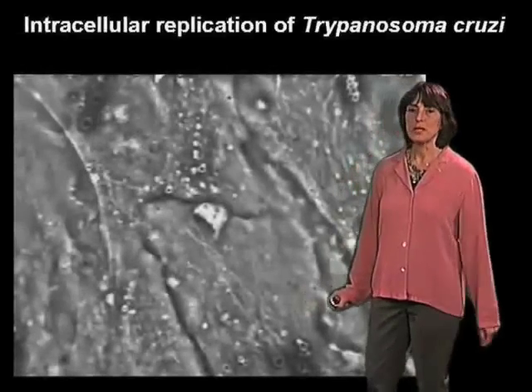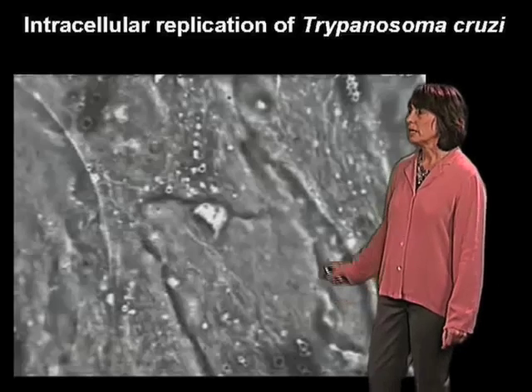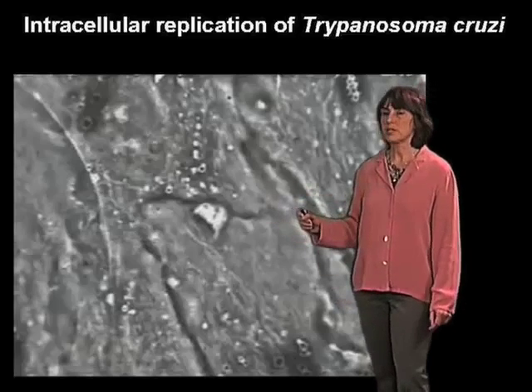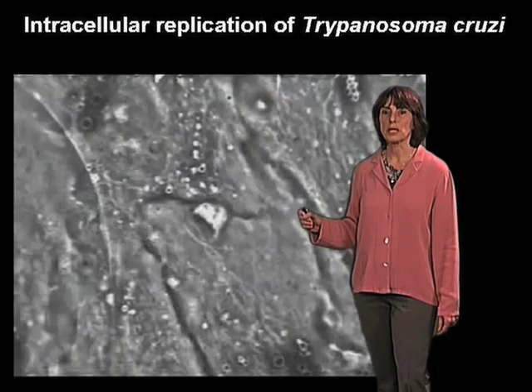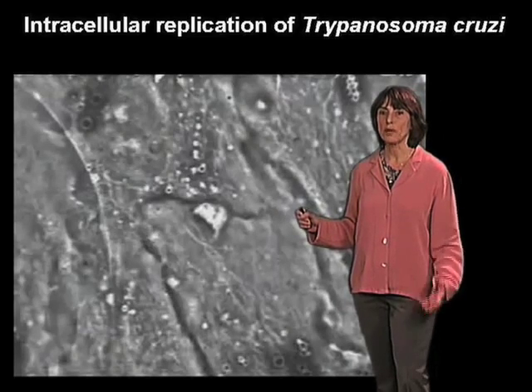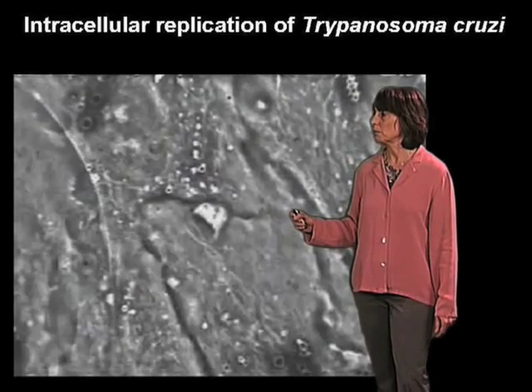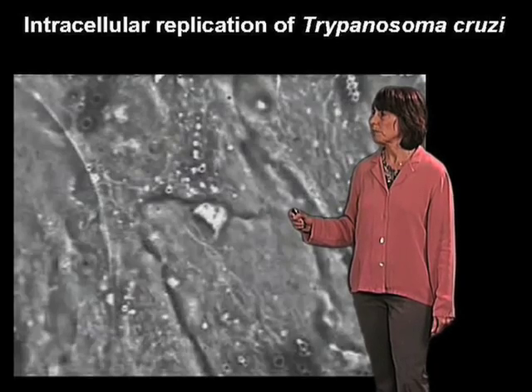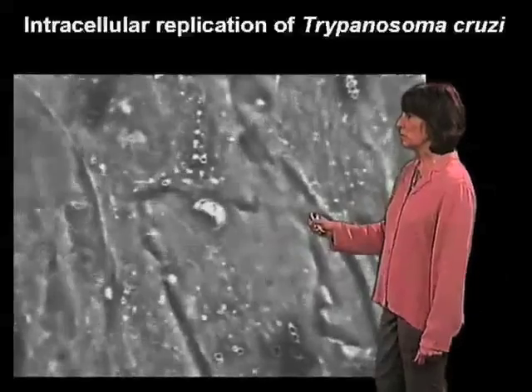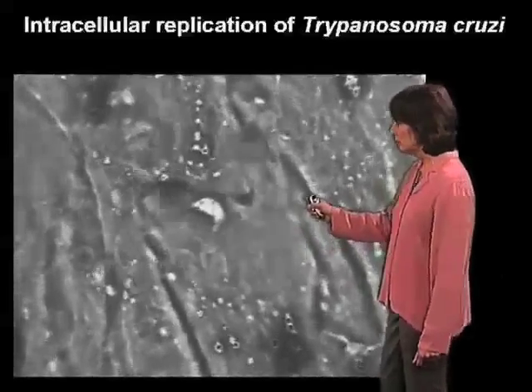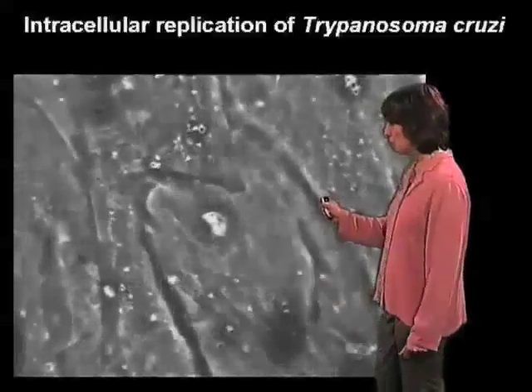What I'm going to show you in this movie, made by Erta Meyer in Italy in the 60s, are the last stages of the transformation of the intracellular parasite into the replicative amastigote form. We can see as we play the movie that this parasite, which just entered these chicken retinal cells, is going to reorganize itself into the rounded amastigote form.